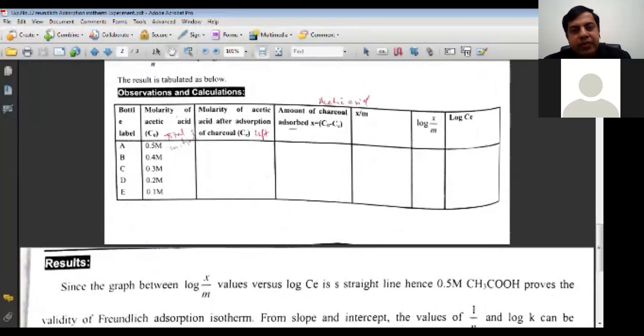So next I am moving to, before showing the video, because this is already recorded in the previous lecture, but I am going to show you the graph. How can you plot the graph in Excel? So just sharing this one again.